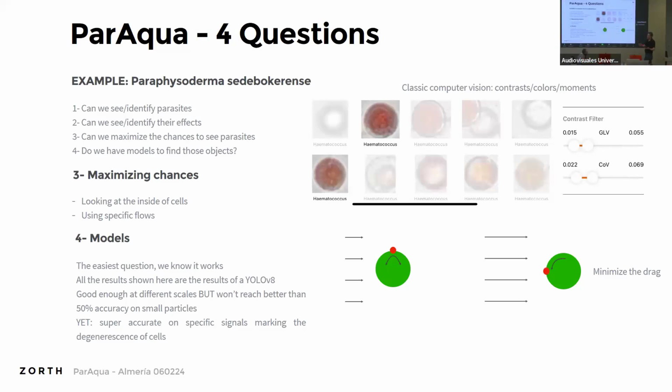Now, fortunately, there are some guys nowadays that are working on new models that are enabling you to scan very large images, because you want a large resolution to see those very tiny things. Scan a very large image using every single tile of the image and reassemble those things. So there's solutions that are coming up that should make this thing manageable.